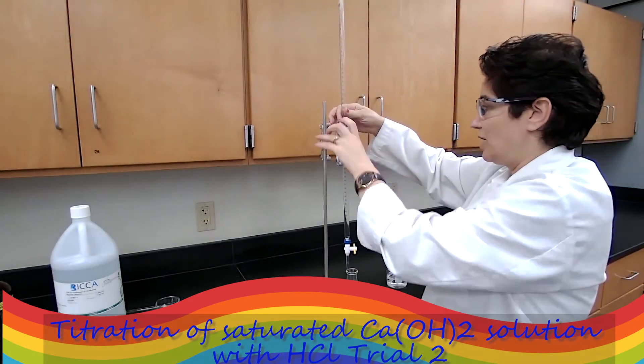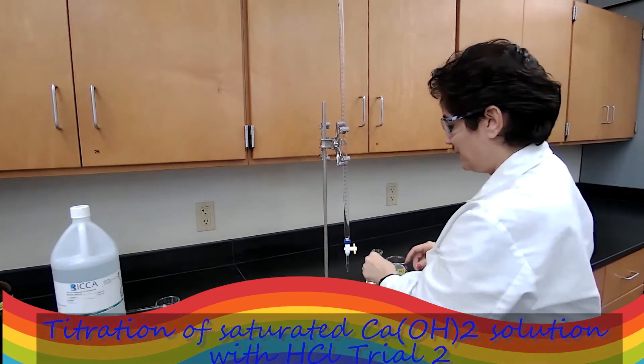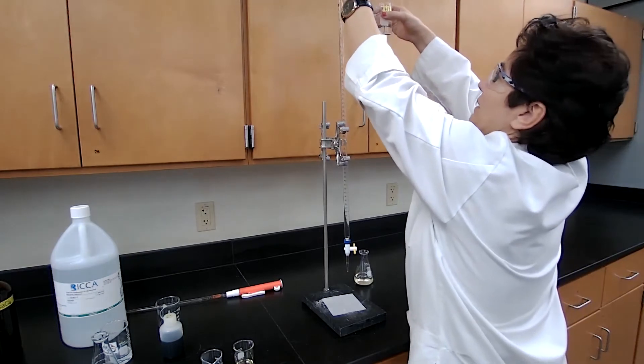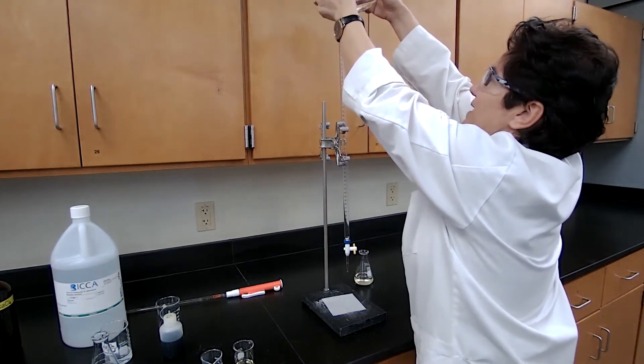I like to always do two trial of the experiment and take average. So I would refill the burette with the HCl, the same solution.